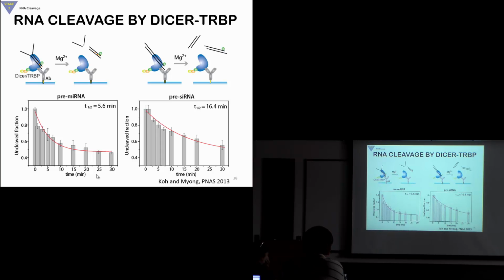How many molecules do we get? Typically, for high throughput, about 300 to 400 molecules. It depends on the density. I know some students typically have 600 to 700, but they're reaching the limit of not being able to detect single molecules. A healthy range would be 300 to 400. Protein binding events may be more rare depending on the protein concentration. But compared to optical trap kind of assays, this is a truly single molecule assay with much higher throughput.